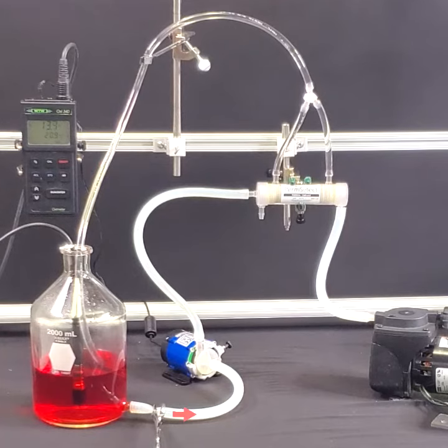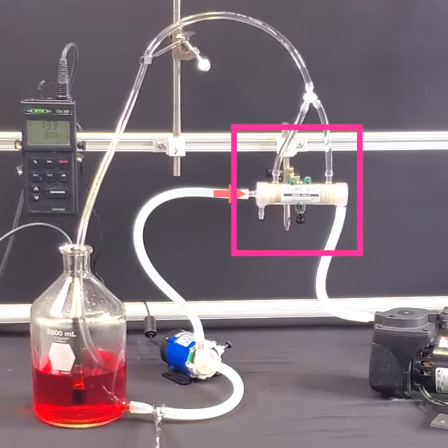Water is drawn from the bottom spout of the bottle with a Levitronix centrifugal pump and directed to the shell side of the membrane gas exchanger.